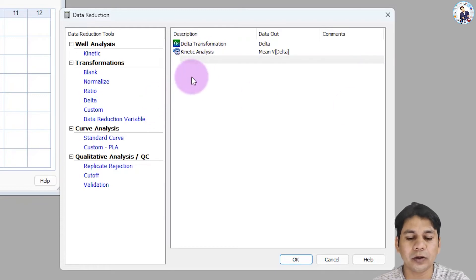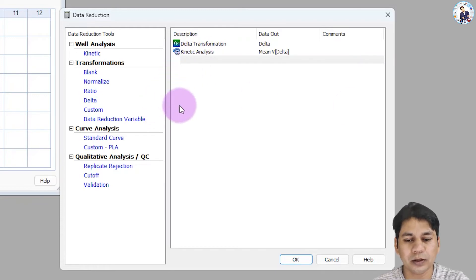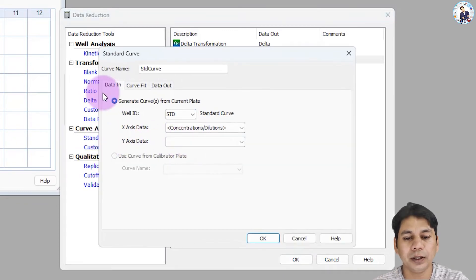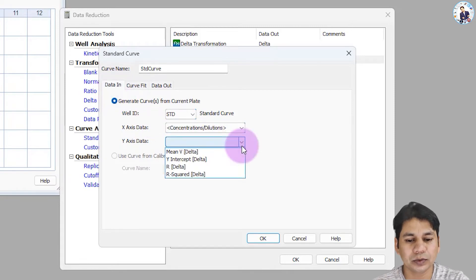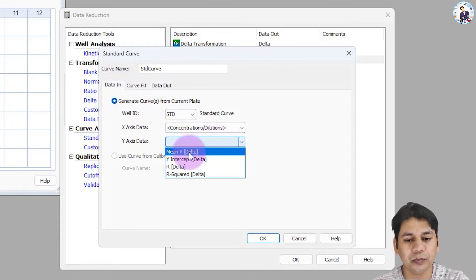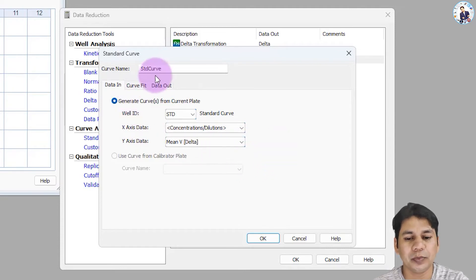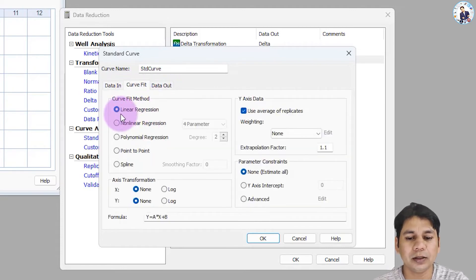After this, we will create the standard curve for this plate. Click on the standard curve. The data input is the mean value of the standard, and the mean value of the standard will be taken for the standard curve preparation. For the curve fit type, by default it is linear, so I am going with linear regression. Click OK.